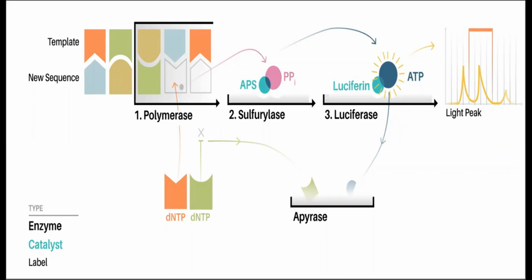It is basically, for example, like a microtiter plate, where there is a well sort of thing. In the same way, you have the same thing for an NGS as well, whereby you apply your samples on the well, and then you apply your new DNA polymerization, right? So you go for DNA polymerization, new nucleotides will be coming in. You have applied your DNA polymerase over here. There is a free 3' OH group available here.